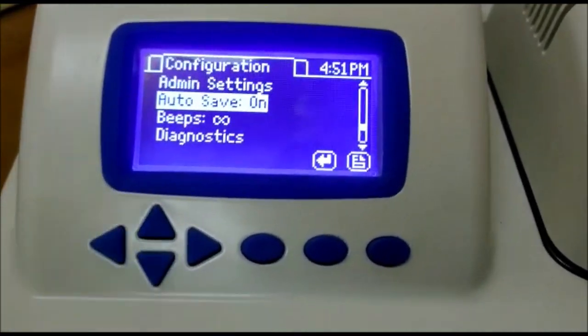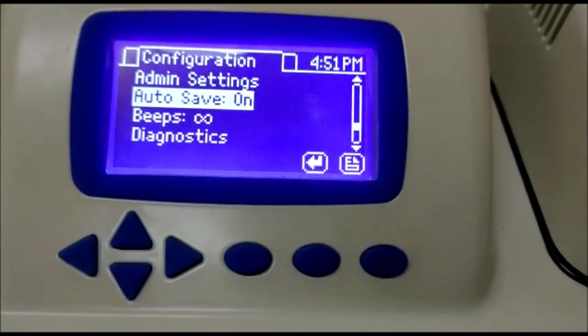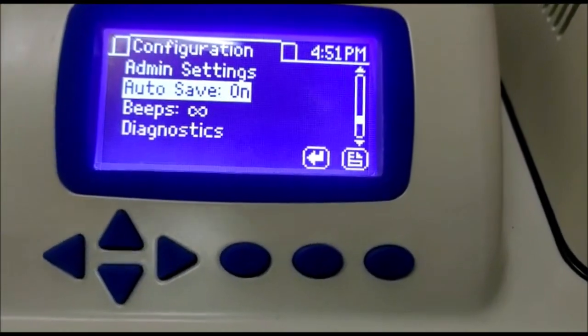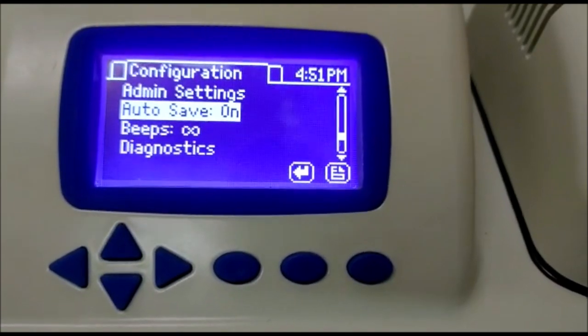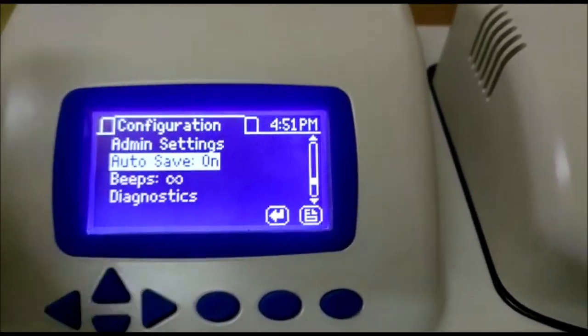Auto save on. It means that it can save results in the memory. Aqualab 4TE can store 8000 results in the instrument.